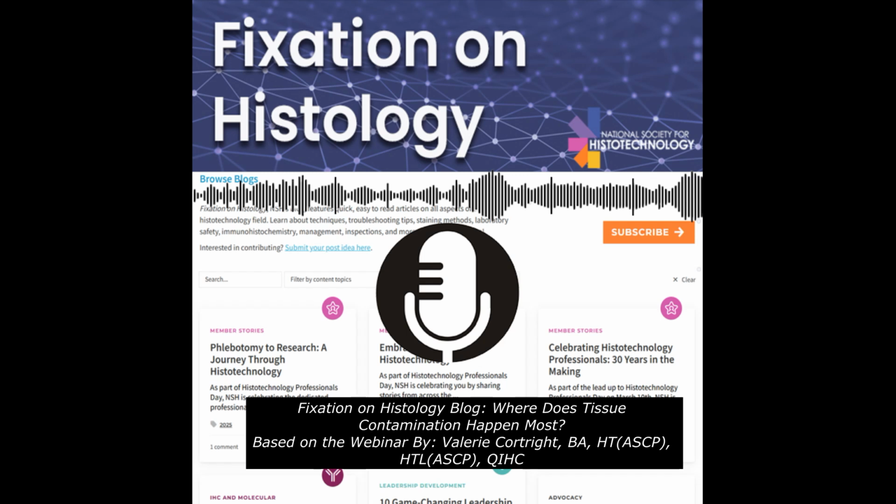Gross rooms. The gross rooms can have a lot of traffic coming in and out. And if a lab has multiple people using the same bench for different cases, there is a high possibility that contamination can happen, especially since histotechnologists may share the same instrumentation and don't have time to clean it after each use. Using the benches for different types of cases is a concern.